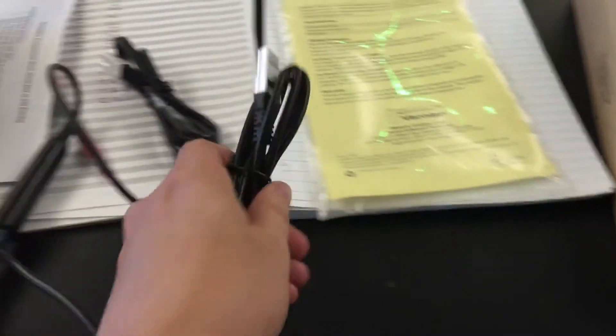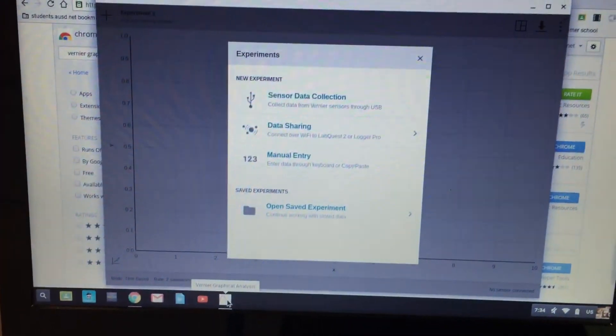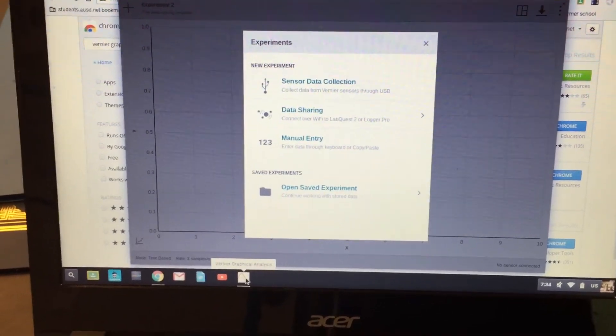But it's just like all the other probes. You plug this end into the Golink cable and then the data is displayed on the screen instantaneously.